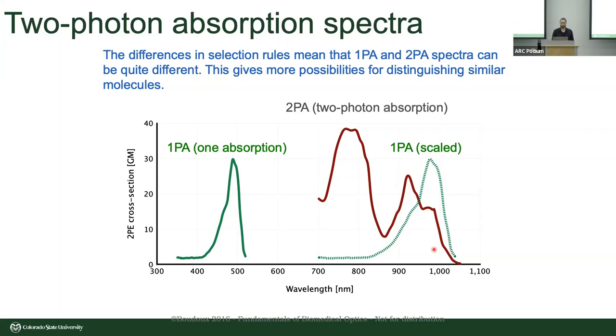So as you're thinking about experiments you might be able to do on this system, it is important to note that if you're using something like GFP, often we need to change that fluorescent protein. We need to change, for example, from an Alexa 488 to an Alexa 546. So that is something to take into consideration. And of course, we can discuss that if you're interested in using the system.